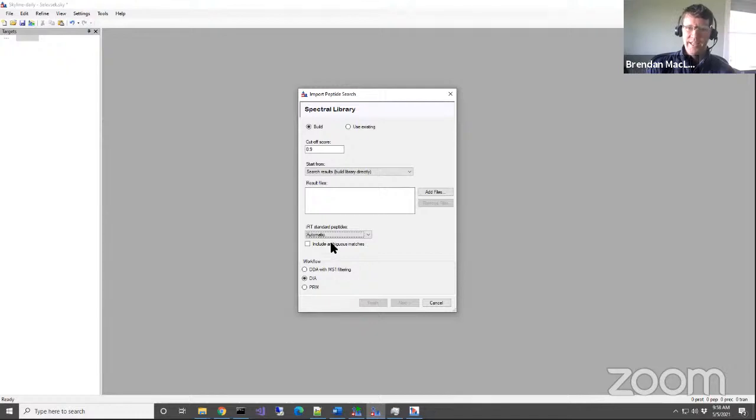An ambiguous match, I guess if you hover over it, will it tell me? No. It should, I would like it. That's something we'll have to fix too. I think frequently when you hover over these things, you'll get some sort of tip. I don't know why it's not working.